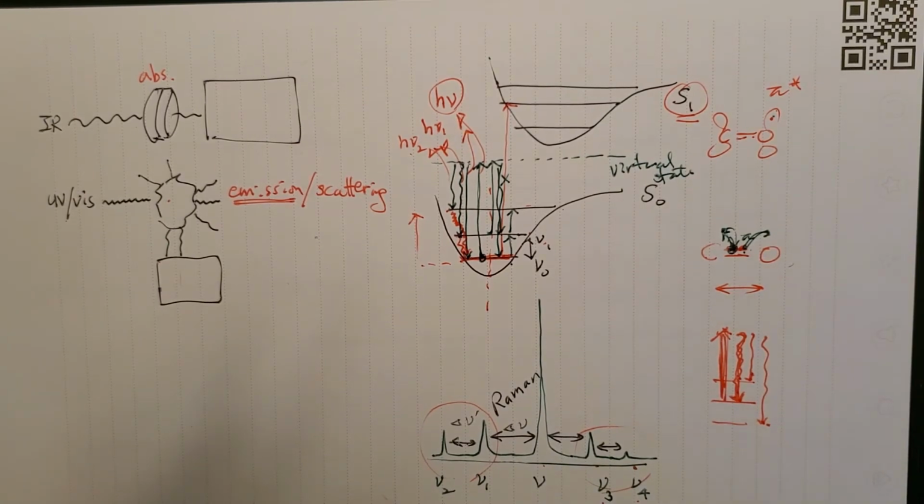As you can see, Raman spec is very clever. It's really a clever way of extracting the data of the vibrational energy, while not really exciting the vibration directly.